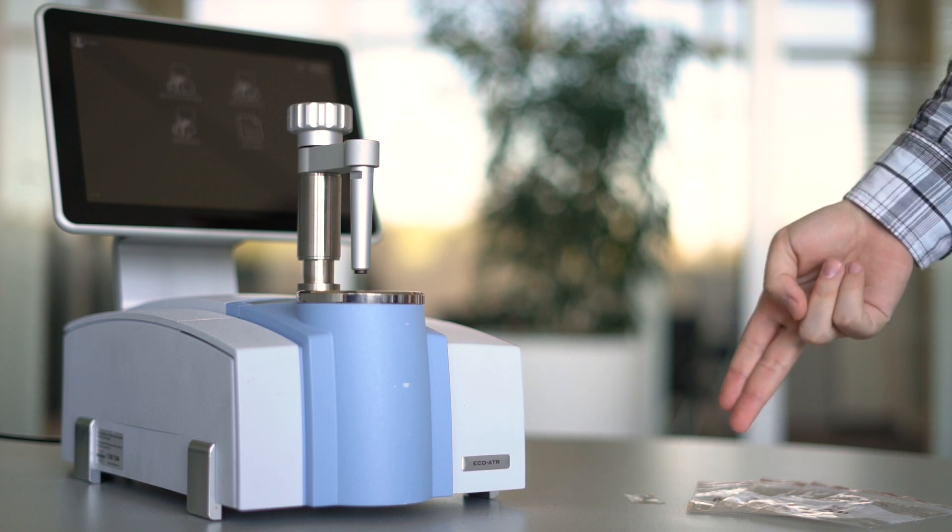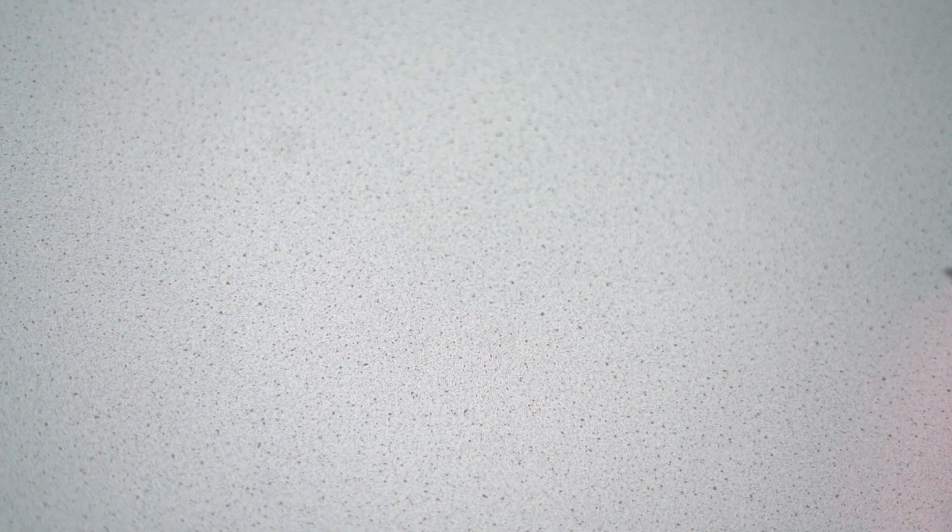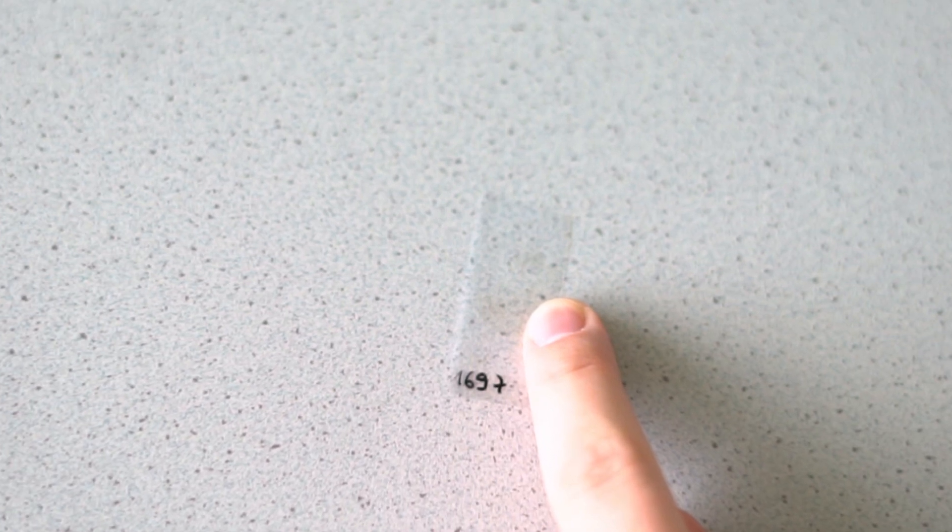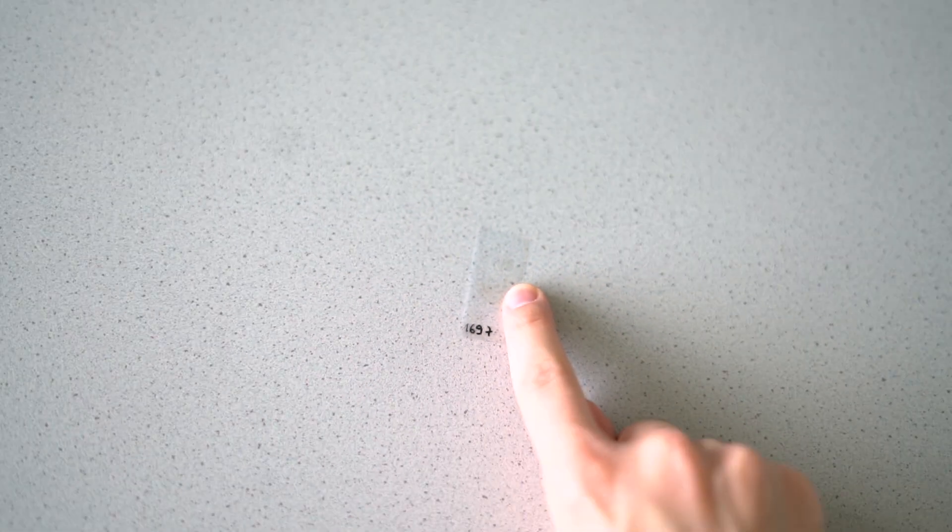Foils and films can be analyzed without any prior sample preparation. Let me show you how it's done with these snippets of a coated polymer film using FTIR spectroscopy and the Alpha 2.